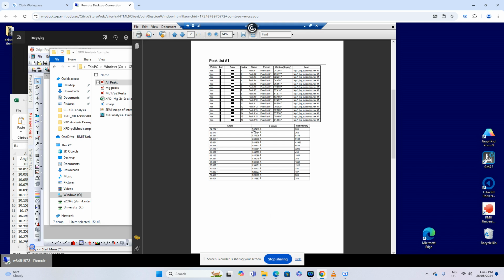So we can see that we can actually view a lattice at high resolution with a d spacing of 0.367. So these two characterization techniques actually complement each other. From the XRD machine we obtain the diffraction angles, and we also have information about their corresponding d spacings. So now we know that we have a peak at 24.204, then we have 29.47, 32, and similarly we have a peak at 81 degrees, right?